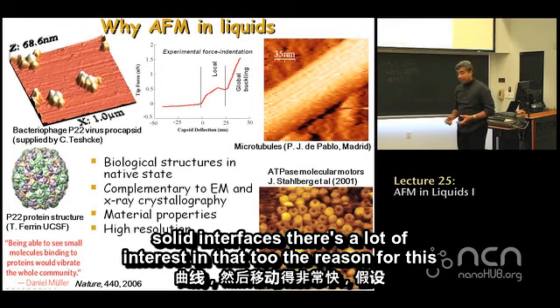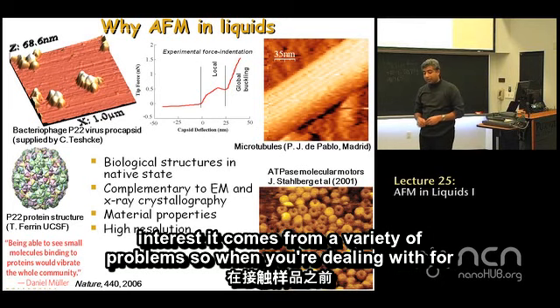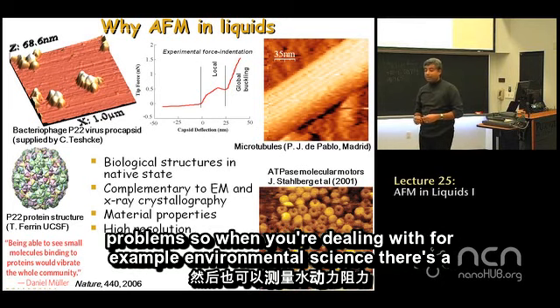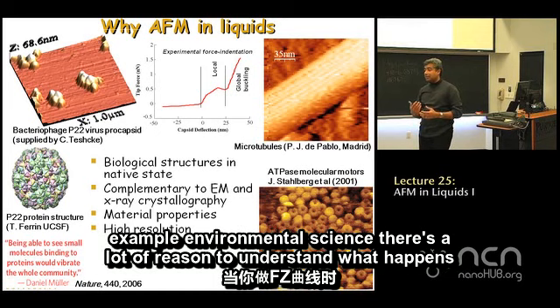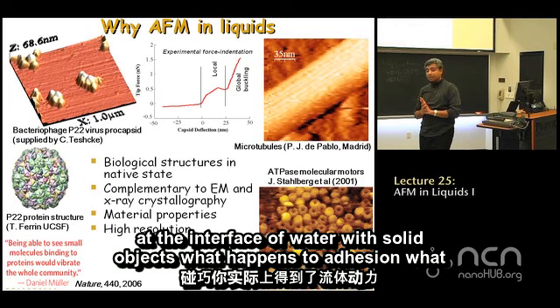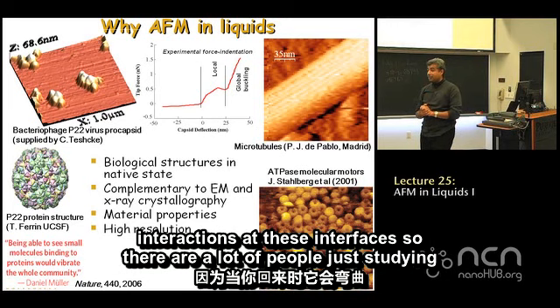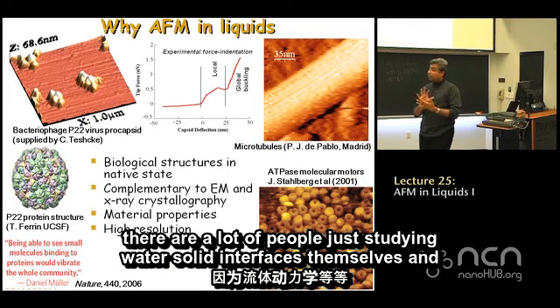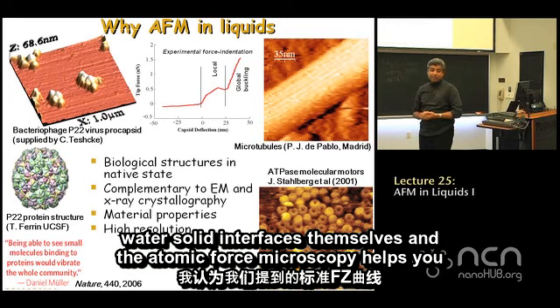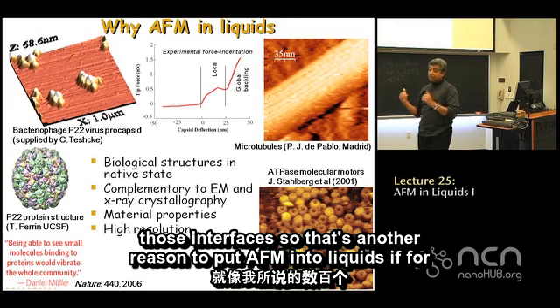The reason for this interest comes from a variety of problems. So when you're dealing with, for example, environmental science, there's a lot of reason to understand what happens at the interface of water with solid objects, what happens to adhesion, what happens to chemical interactions at these interfaces. So there are a lot of people just studying water-solid interfaces themselves. And atomic force microscopy helps you really measure interaction forces at those interfaces. So that's another reason to put AFM into liquids.